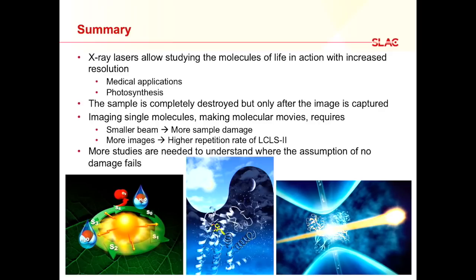I only showed a couple, but those two, the photosynthetic cycle, as well as understanding medically relevant molecules and how they bind to drugs, are two very important areas that we are pursuing. The sample is completely destroyed, but only after the image is captured. And that is really amazing, in my opinion.